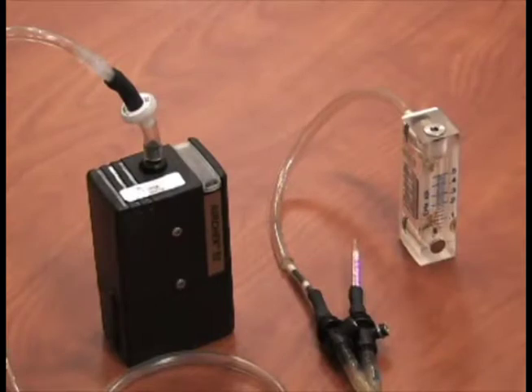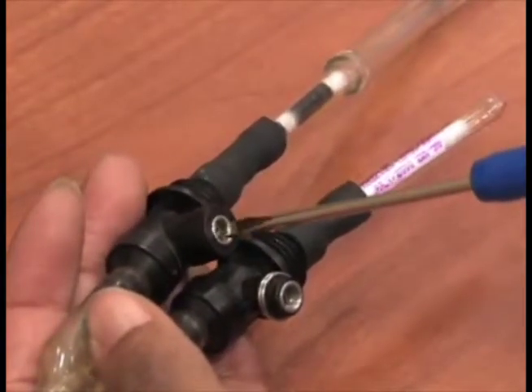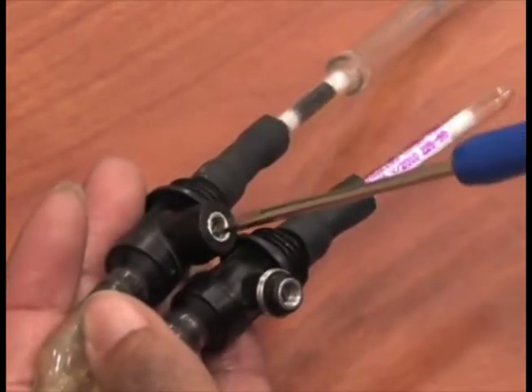Using dual and triple splitters is an alternate way to take two or three samples simultaneously using just one pump. Splitters can only be used for low flow sampling.